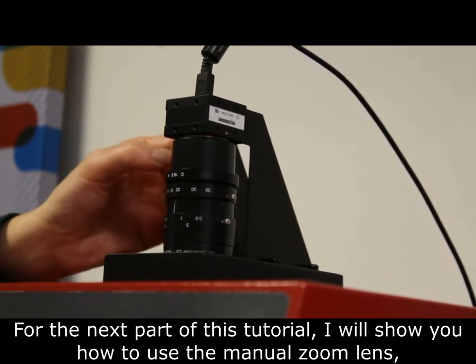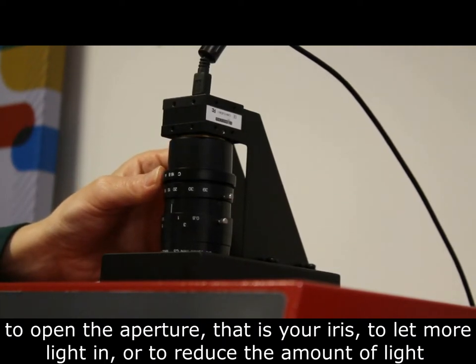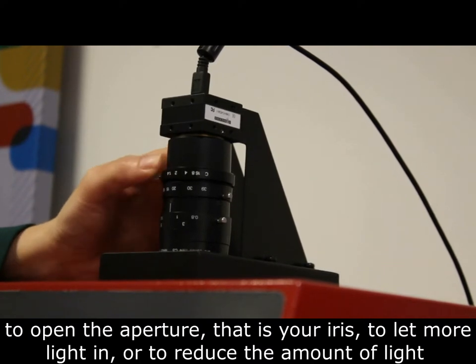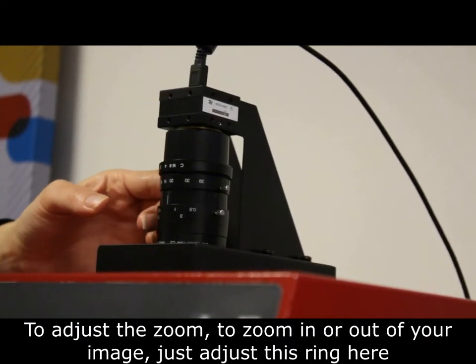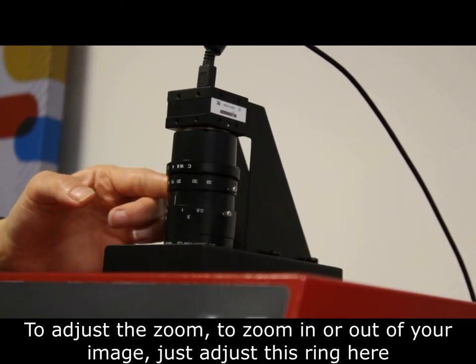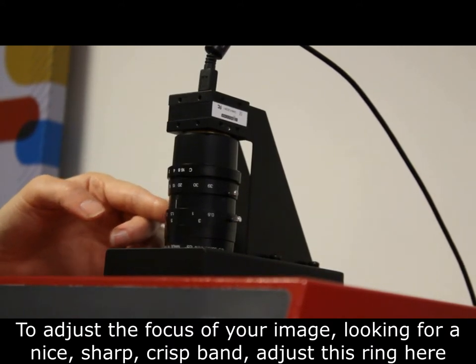For the next part of this tutorial I will show you how to use the manual zoom lens. To open the aperture, that's your iris, to let more light in or to reduce the amount of light, use this ring here. To adjust the zoom to zoom in or zoom out on your image, adjust this ring here. To adjust the focus so you're looking for nice sharp crisp bands, adjust this ring here.